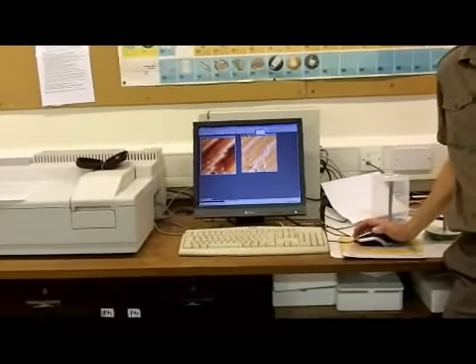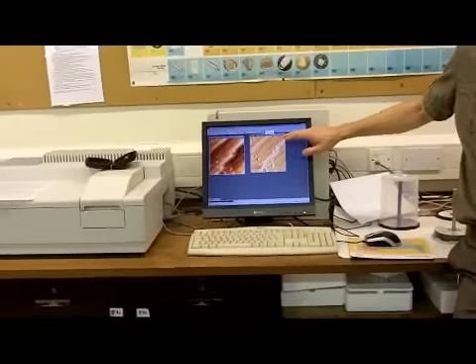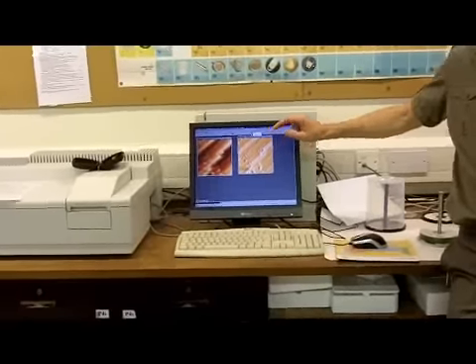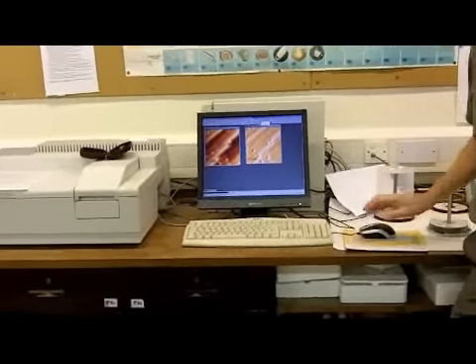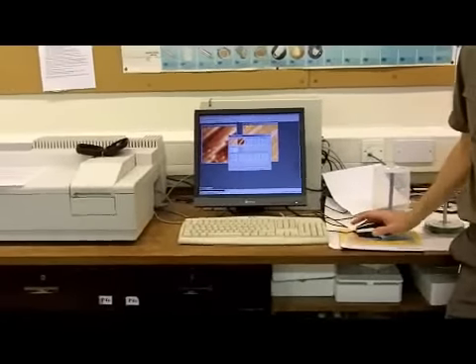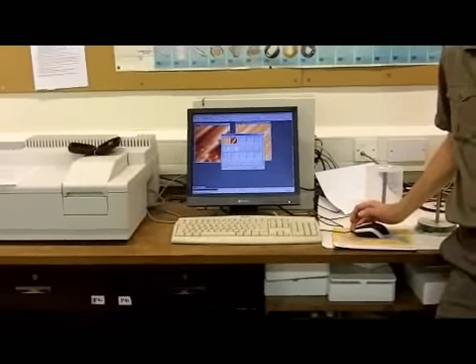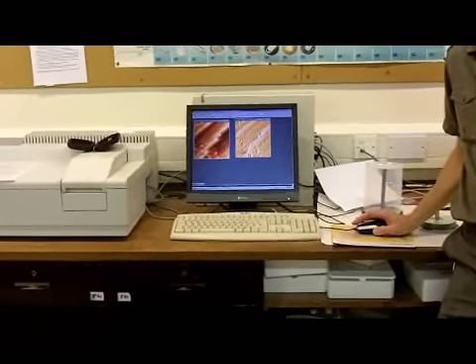There's a single profile, which will record the profile on the active image, which is the one with the blue top, or you can use a multiple profile, which will record the profile on whichever images you want. So we'll go for multiple for the moment, so I can show you the difference. And I'll choose those two images to record, and I'll say OK.